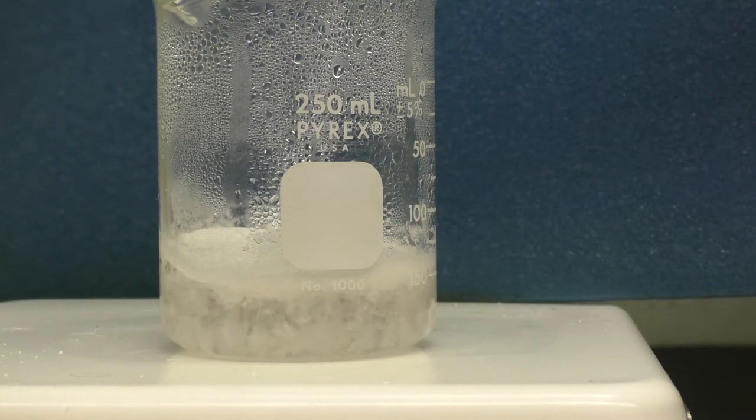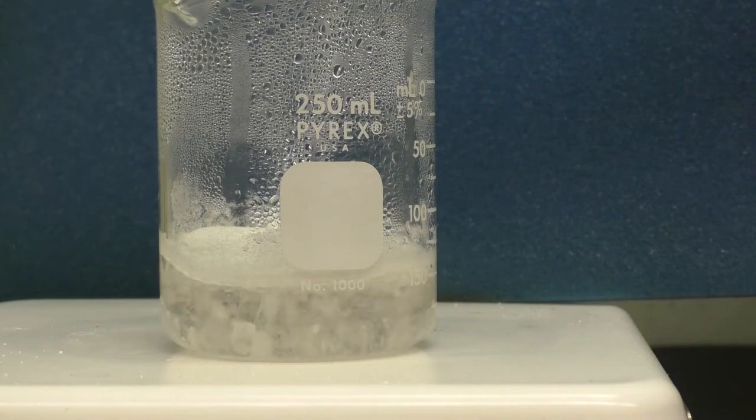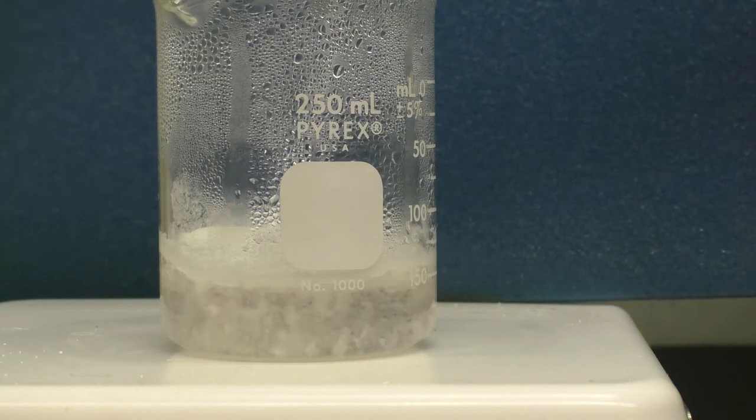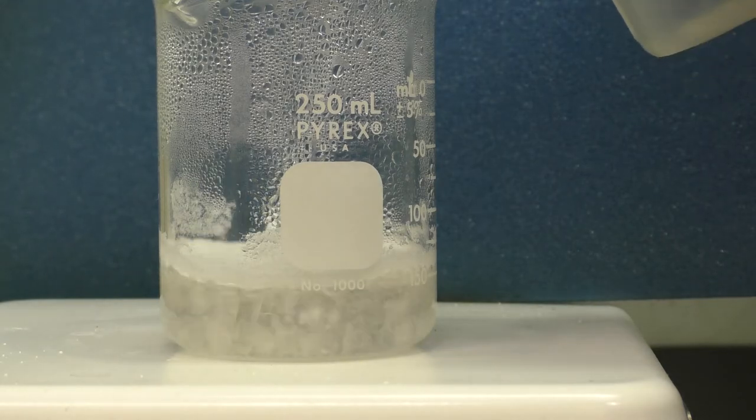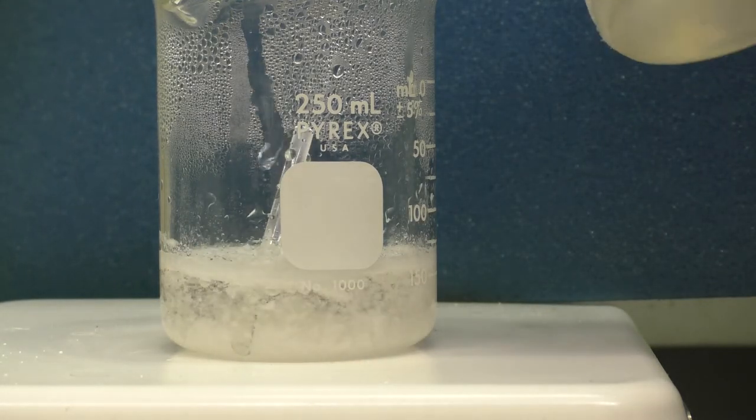Definitely made progress. All of this material really needs to be completely soluble before we are able to let this cool and crystallize. So I'm going to use the small distilled water and add just a bit more water to this. We'll start by just rinsing things down. Then we do need to increase the volume.